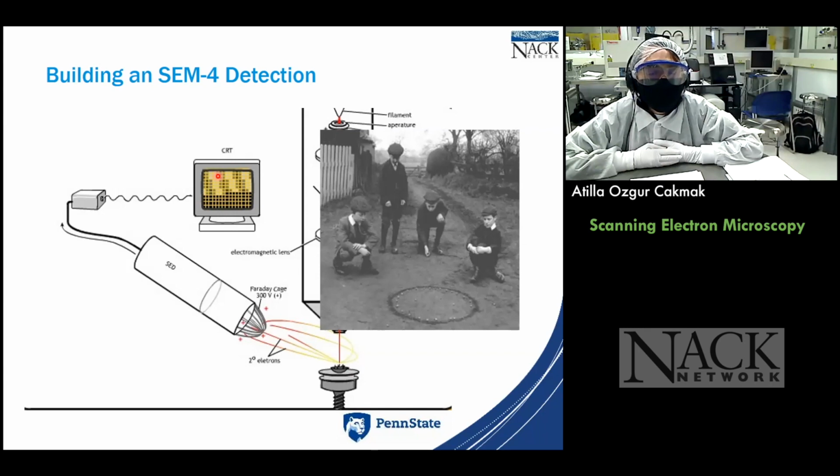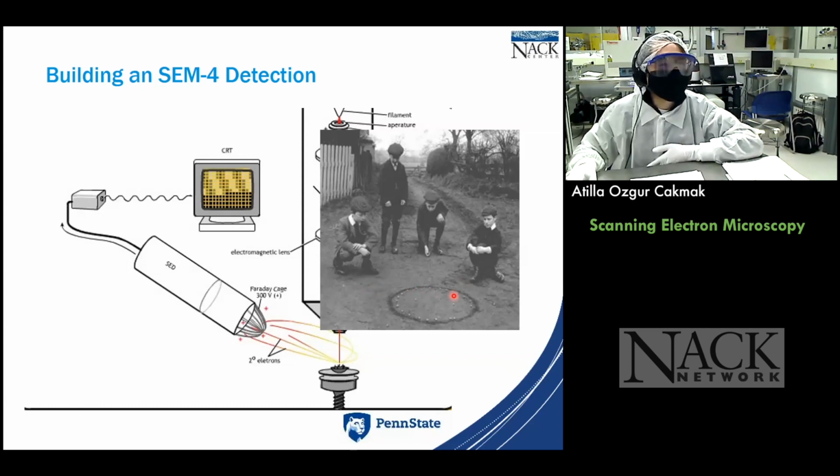Of course, when I give this example to my students, they can't relate because none of them has ever played marbles. Unlike me, I did play with marbles. So it's kind of similar to this. You send your electron, that's the initial marble, into the atoms, that's your sample. Those are the other marbles. Yes, I am old, but not as old as Bob.